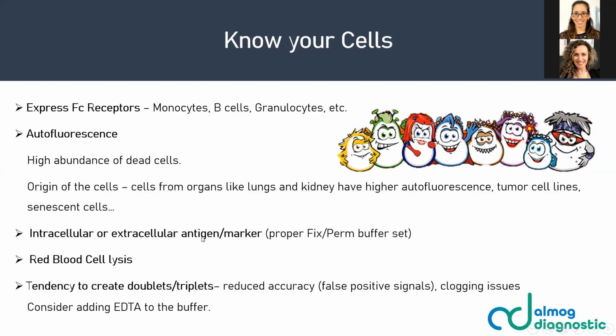Intracellular or extracellular antigen markers, this is also very important to know before. So if you are staining intracellular or intranuclear markers, you need to choose a proper fixation and permeabilization buffer set. Also, all your controls, your compensation controls, and all other controls need to be treated in exactly the same way, with exactly the same fixation permeabilization buffer set.